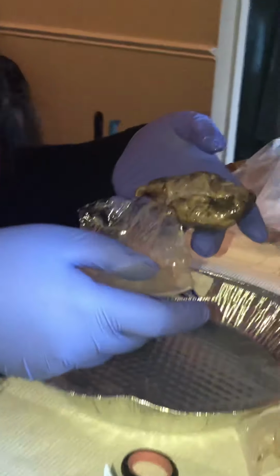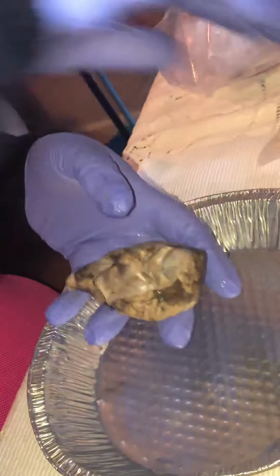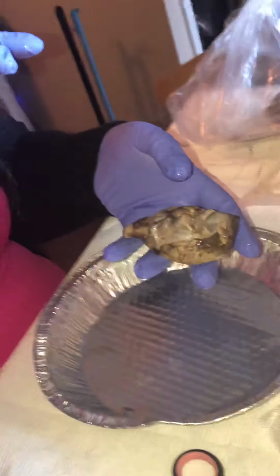And I'm back for part two, Professor Holly, part two of the brain dissection. So let's go ahead and get started. I'm taking it out of the package, and let's jump right into it.